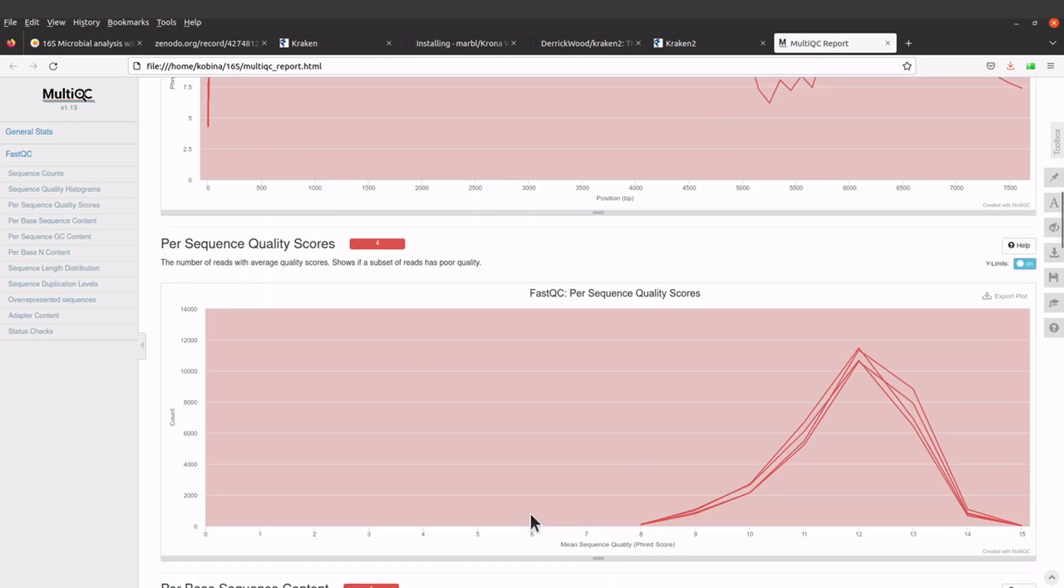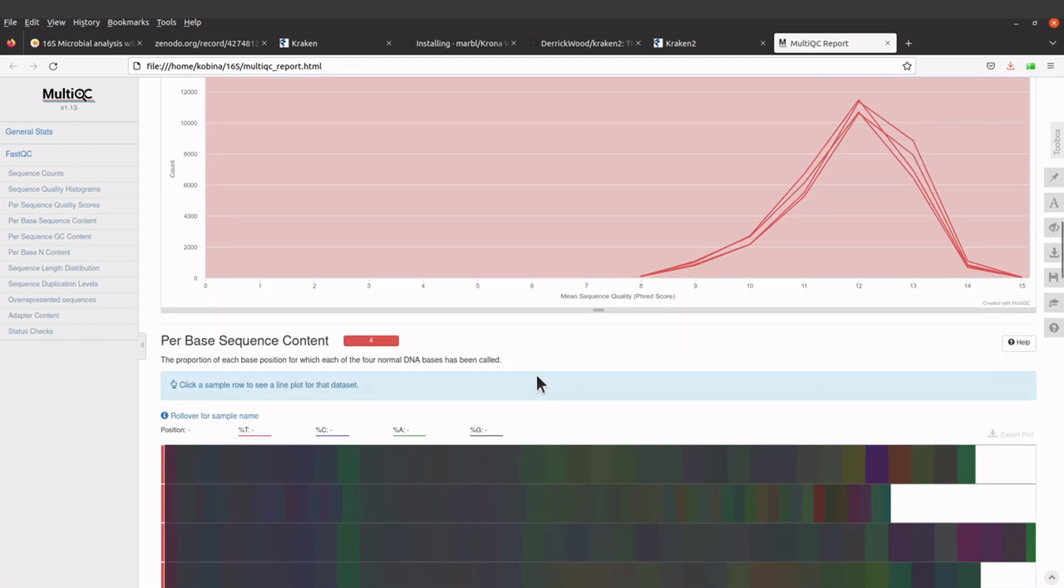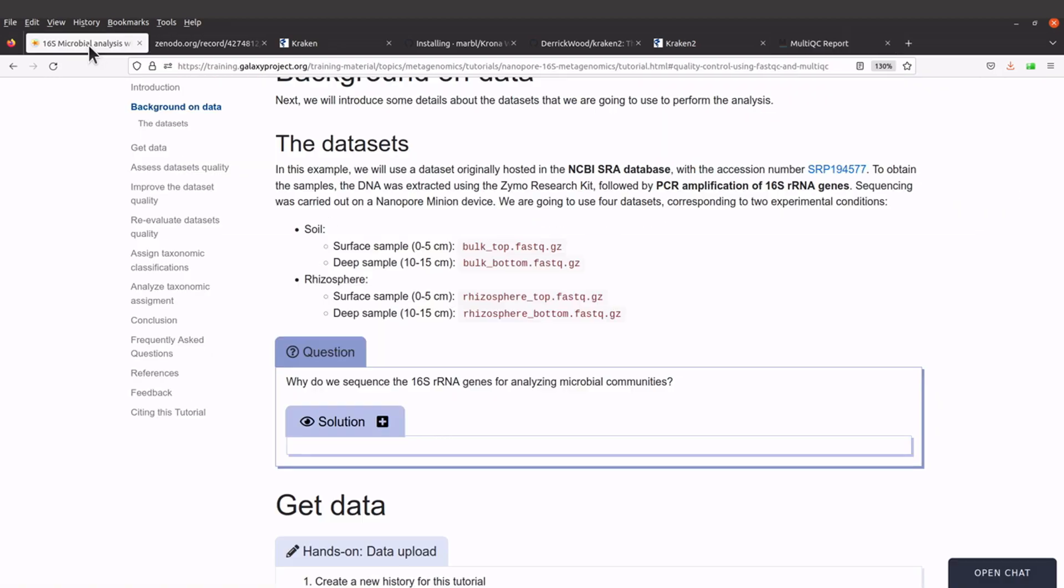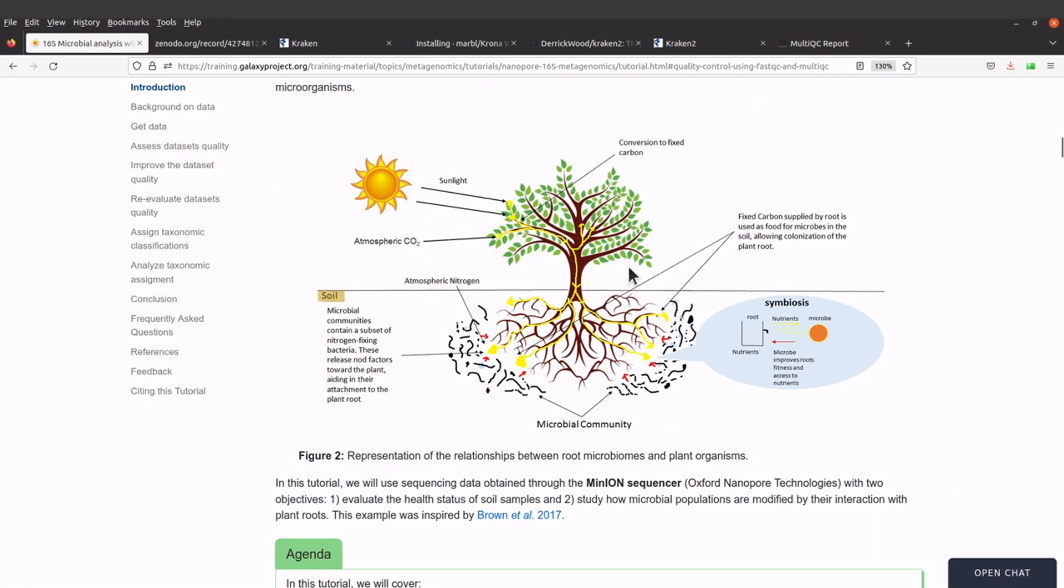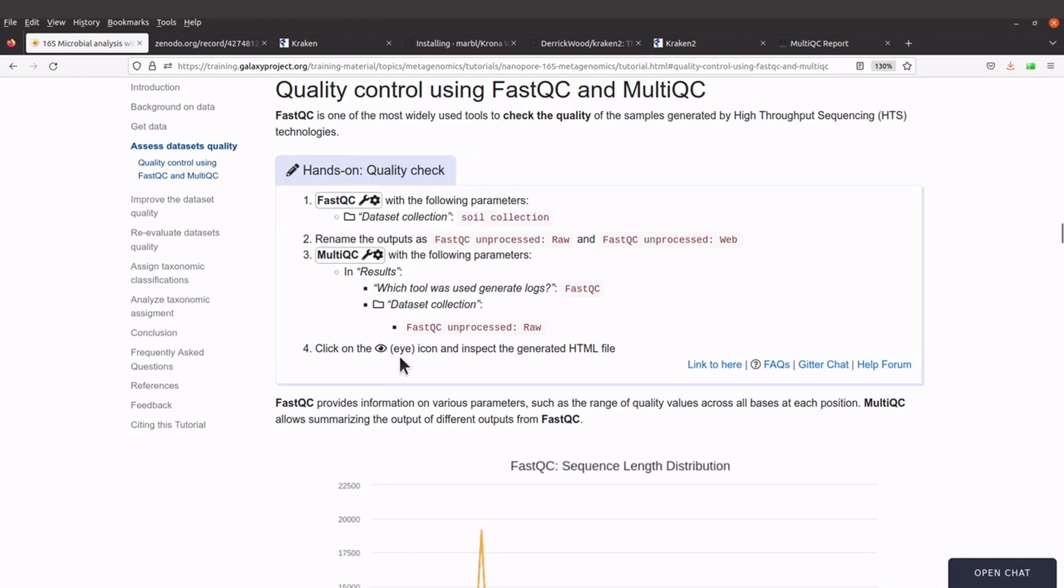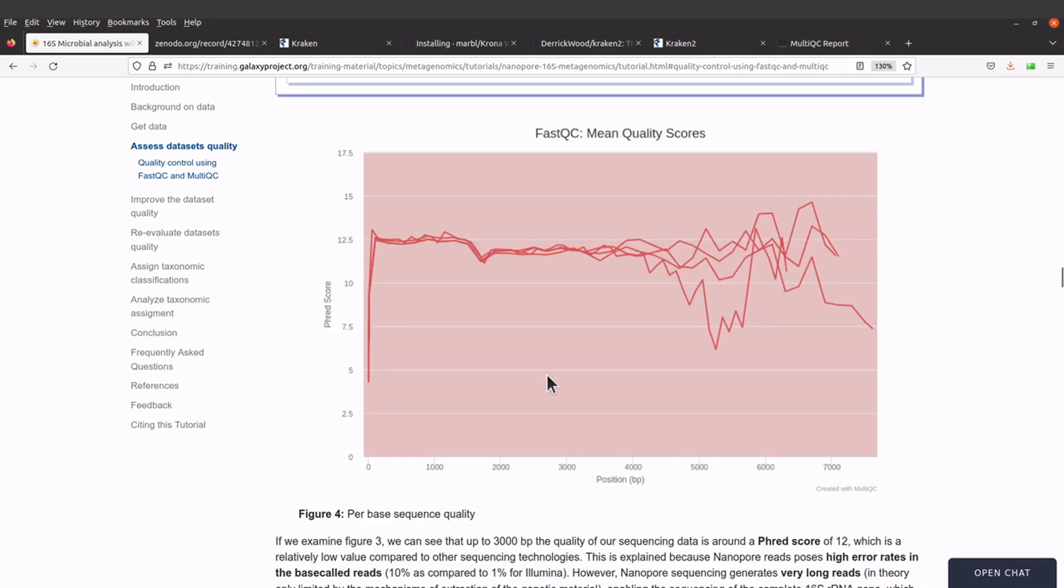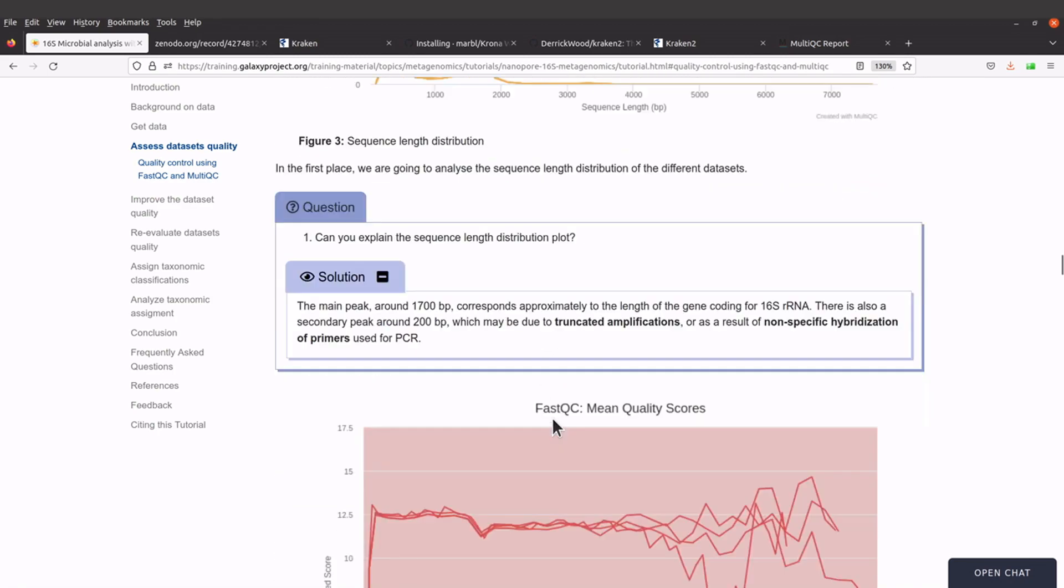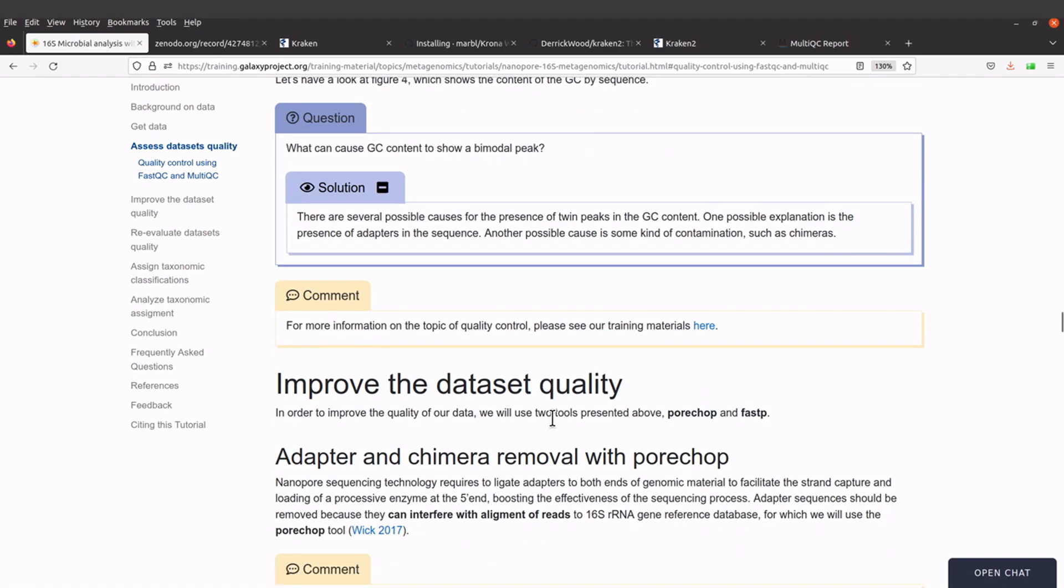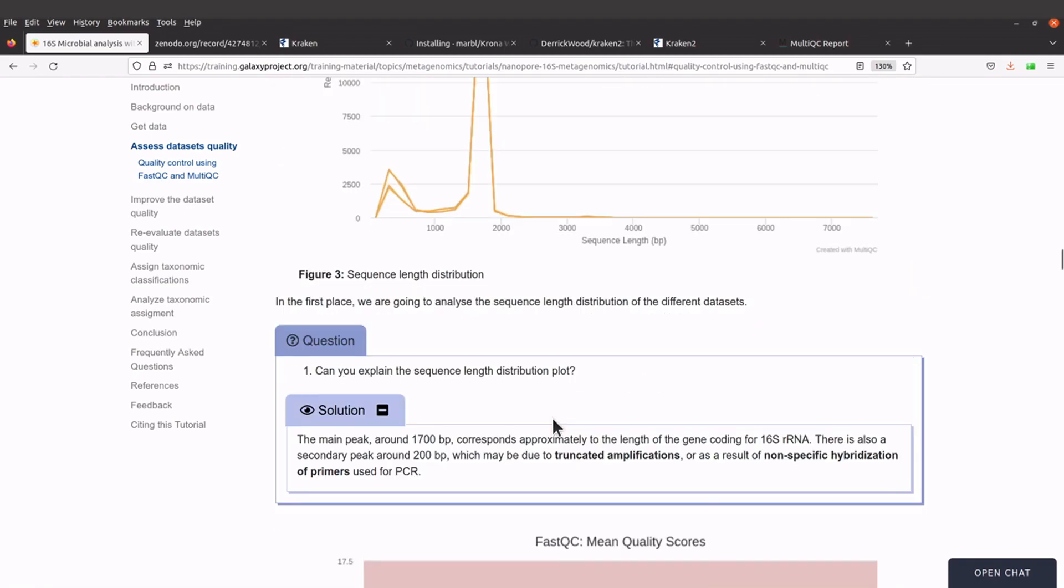Explanation for this report can be found on the Galaxy tutorial page. When you are there, just go to the quality control section and you'll find explanations. We have some plots here and statements explaining what these plots are.